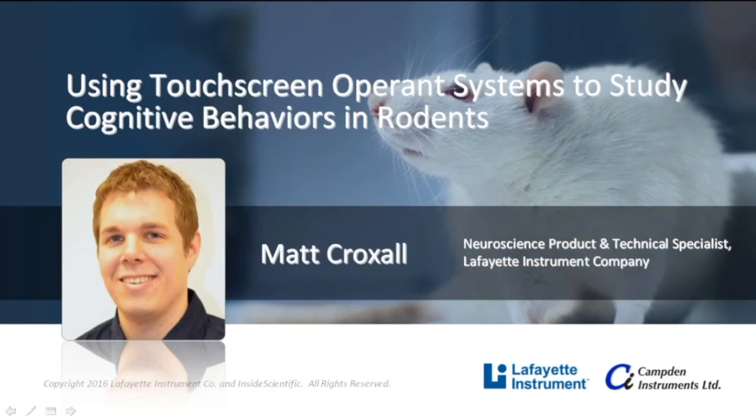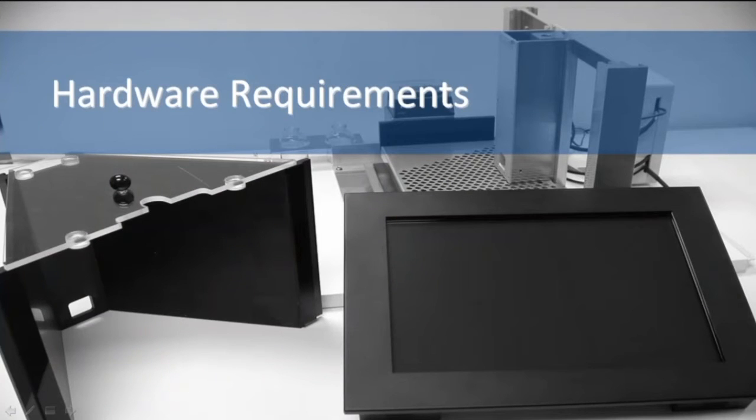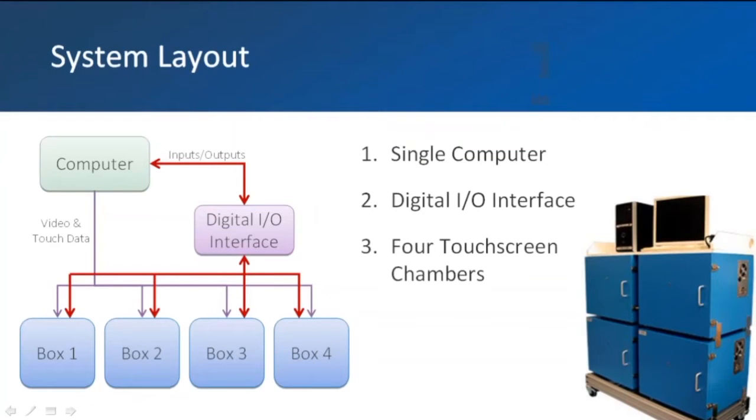As mentioned, I'll be walking us through some of the information on the hardware and software components of the Bussey-Saksida touchscreen system. We'll start by taking a look at a general overview of the system.